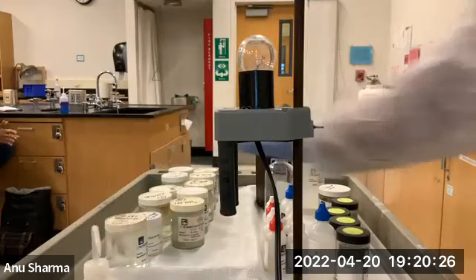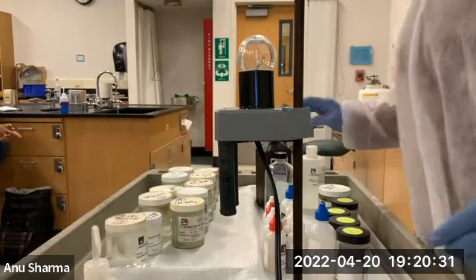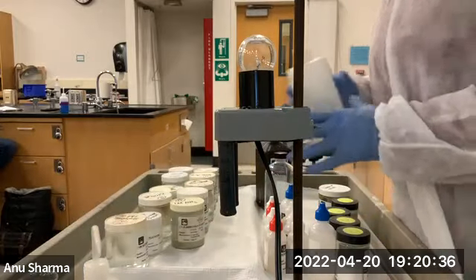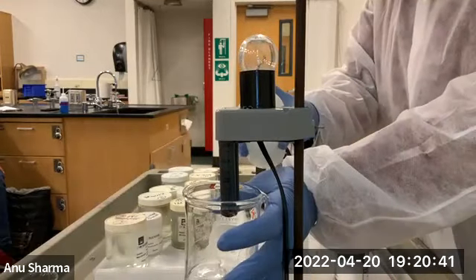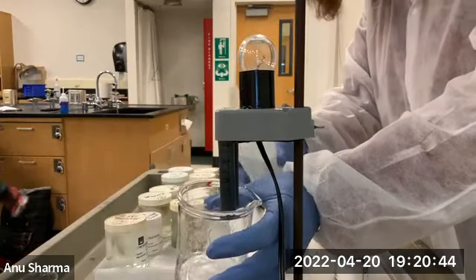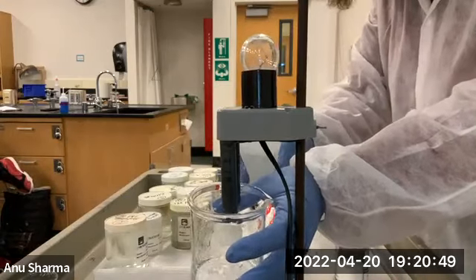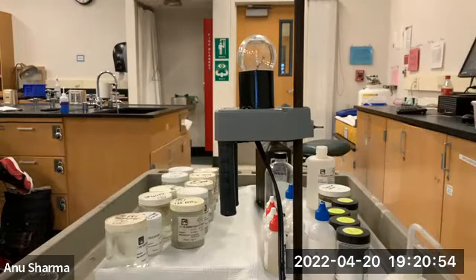Now the next is number 9, which is 1 molar HCl. 1 molar HCl means hydrochloric acid, and the molarity is the concentration of hydrochloric acid. Pretty strong. Hydrochloric acid is one of the strongest acids. Anyway, every time I'm doing it, I have to clean this. I don't want any residual, and ideally I should be using a Chem wipe, but I don't see it here. Okay, just clean it up.